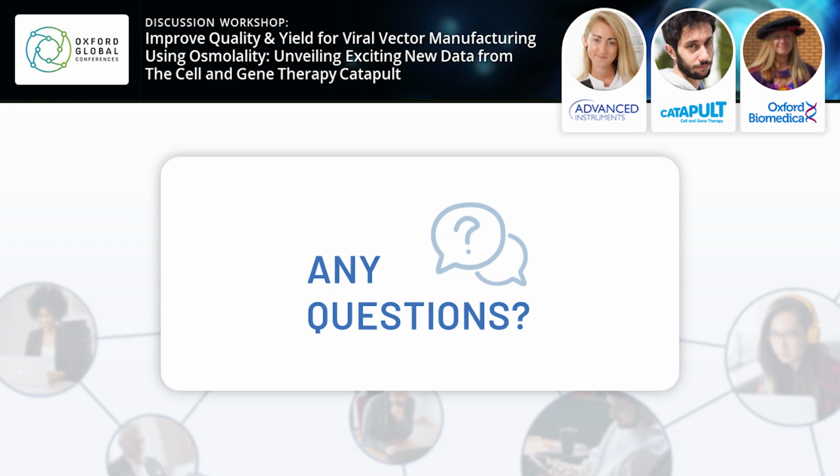And so it's not the same system, but in my case, for AAV, it could be a critical process parameter, like pH, let's say.